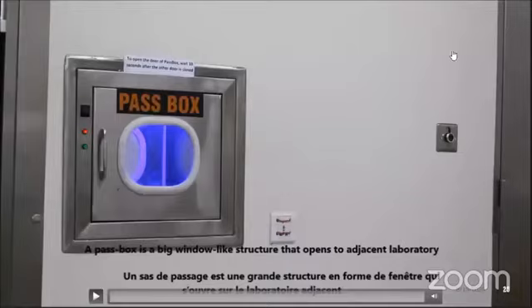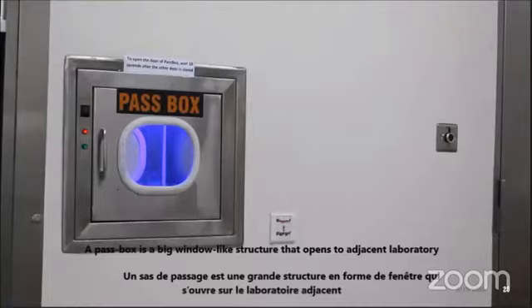Welcome back. Now, the manual RNA extraction is completed. So, we transfer the RNA for the further processing of RT-PCR through the pass box. What is this pass box?